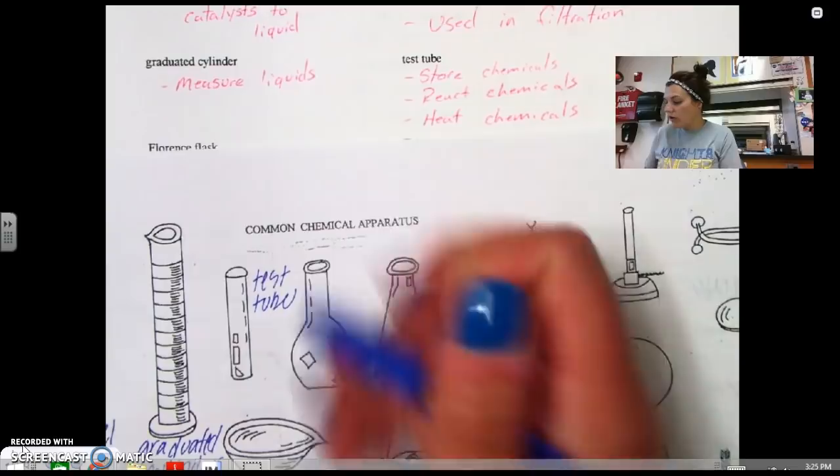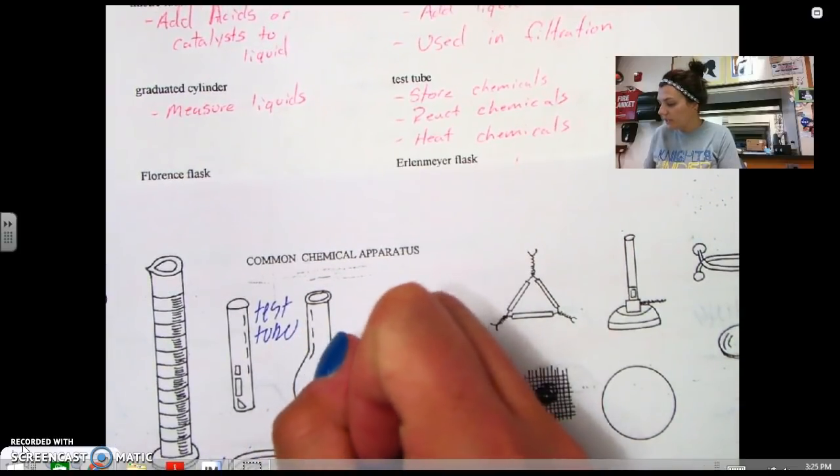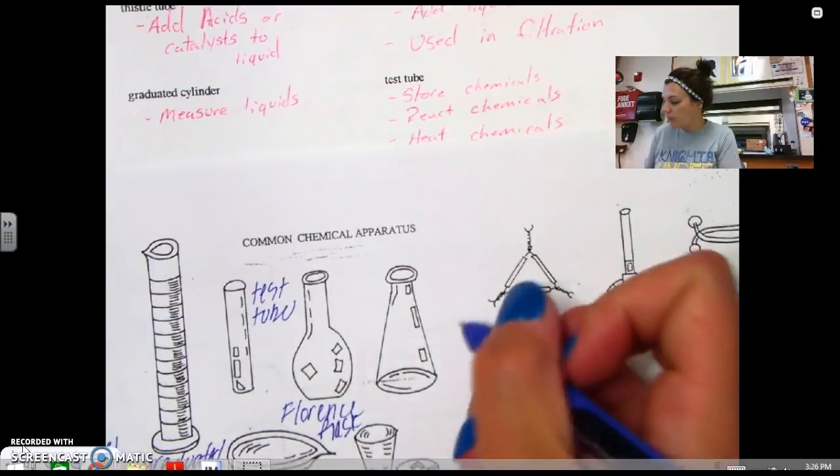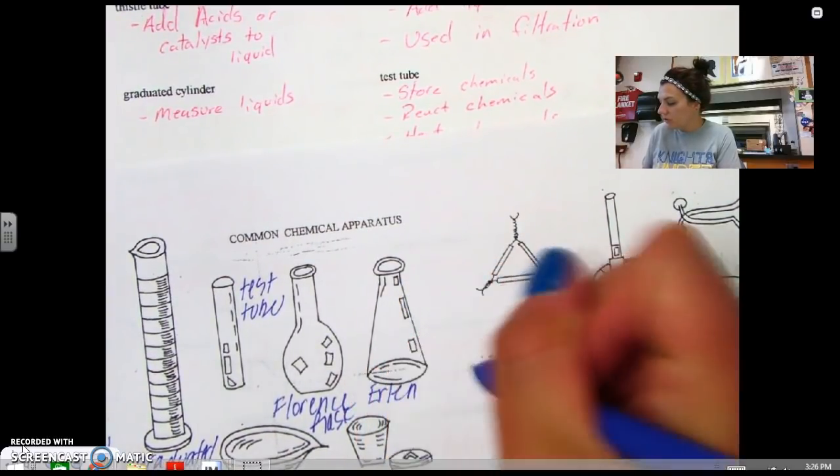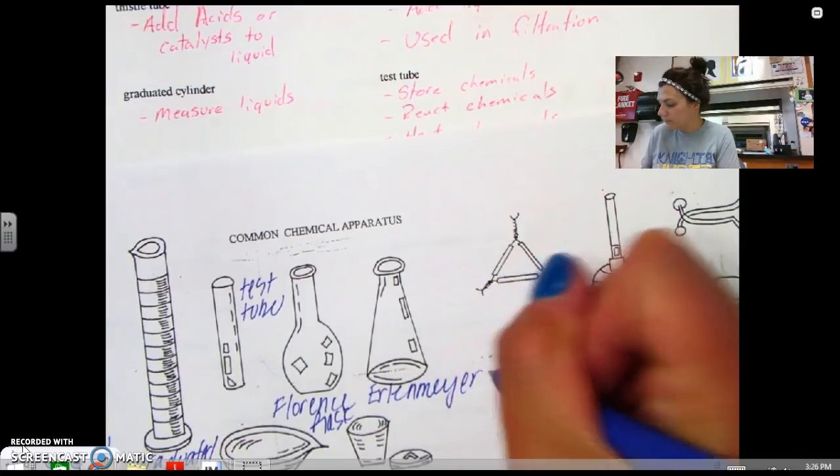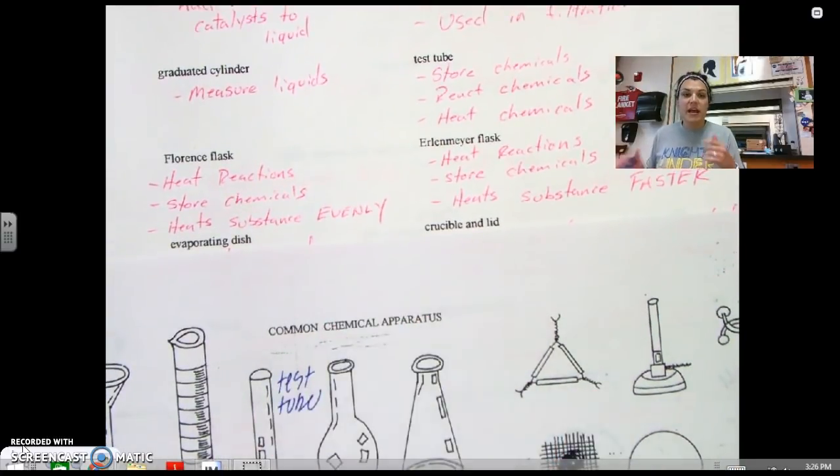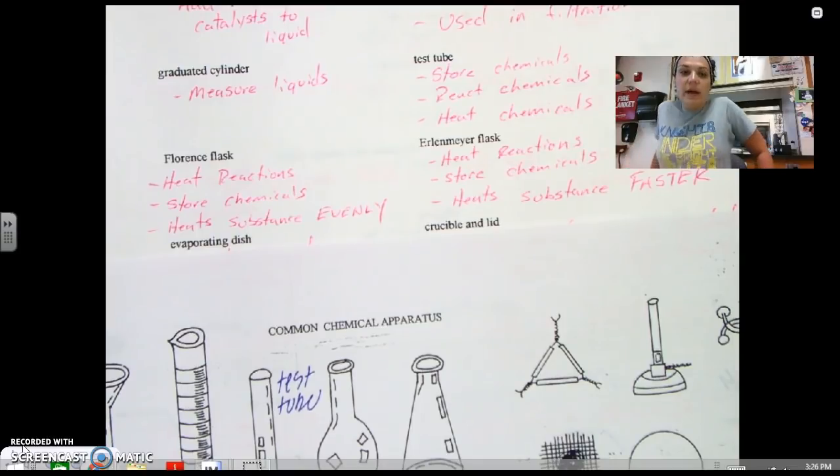The next thing that we have is this thing called a Florence flask. So it's named after some guy. And we don't use these a lot, but sometimes I will store chemicals inside of them. You'll see that this is a kind of a round type flask. They're used primarily to evaporate things off. But you probably won't see one of these again until you take organic chemistry. After the Florence flask, the Florence flask heats reactions, stores chemicals, and it also heats substances evenly.